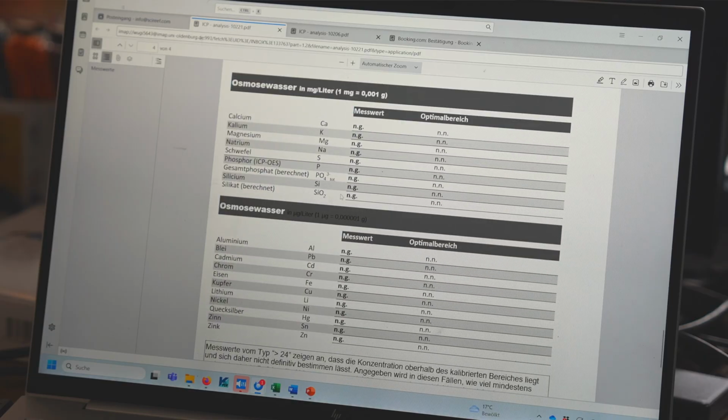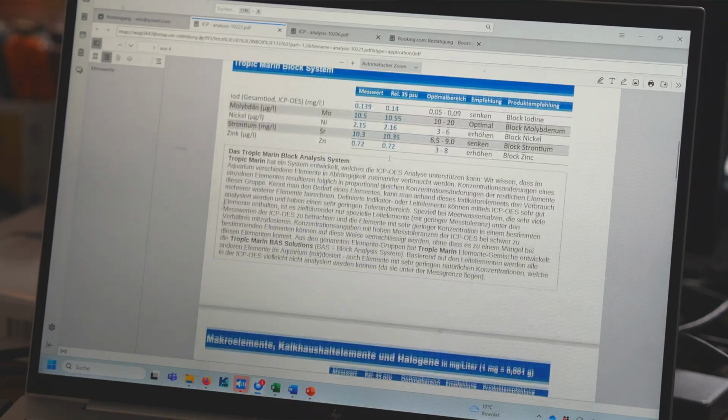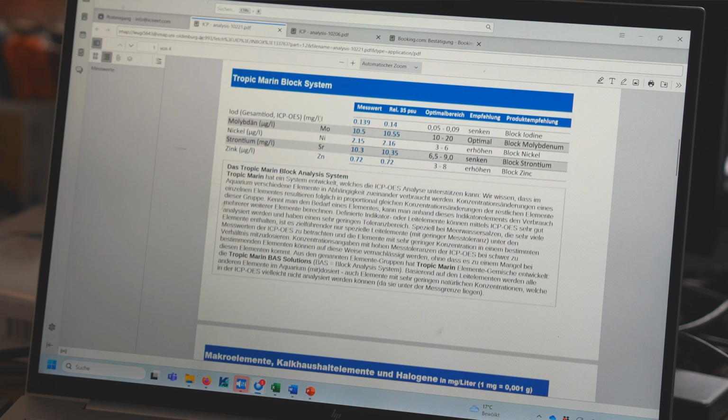So in our case here, with that particular sample, we didn't send in an RO sample because, well, we send in ICPs every week, so we don't really need to test the RODI every week. So sometimes we don't send that sample, then it just says NG for nicht gemessen or not measured. German lesson in between. Okay, so that is basically the report for the ICP Plus that you get via email.